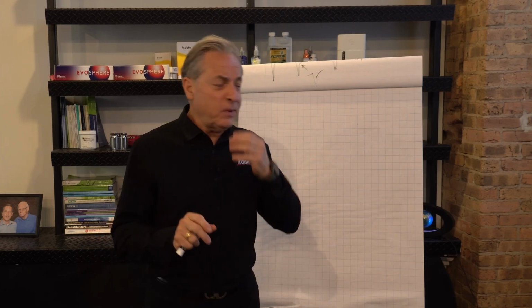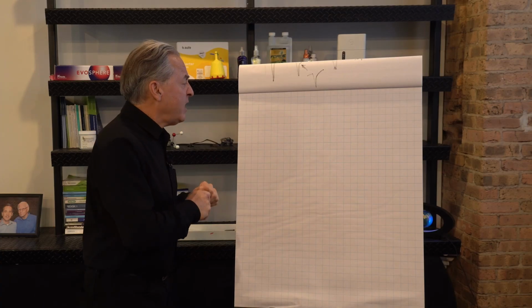So is there another way to get to those ultra high efficiencies without going to really, really small particles? And the answer is yes. And this is what we call superficially porous particles. So let me explain this. Think back to Van Deemter.